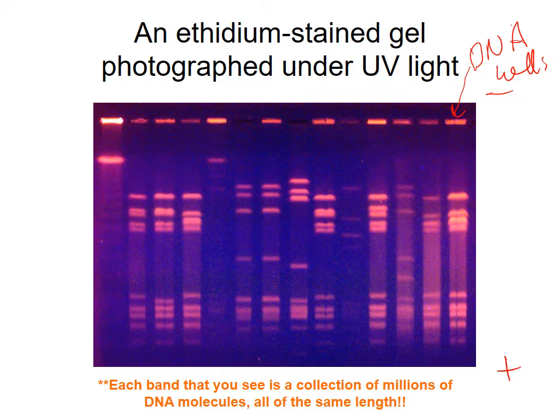This, for example, is like 200 base pairs all the way down here. I said this one is like 15 base pairs. Doesn't matter. It's in that general range. It doesn't have to be specific on how big the segment is in base pairs. But like I was saying, this can be used for investigating and figuring out the good old whodunit question.